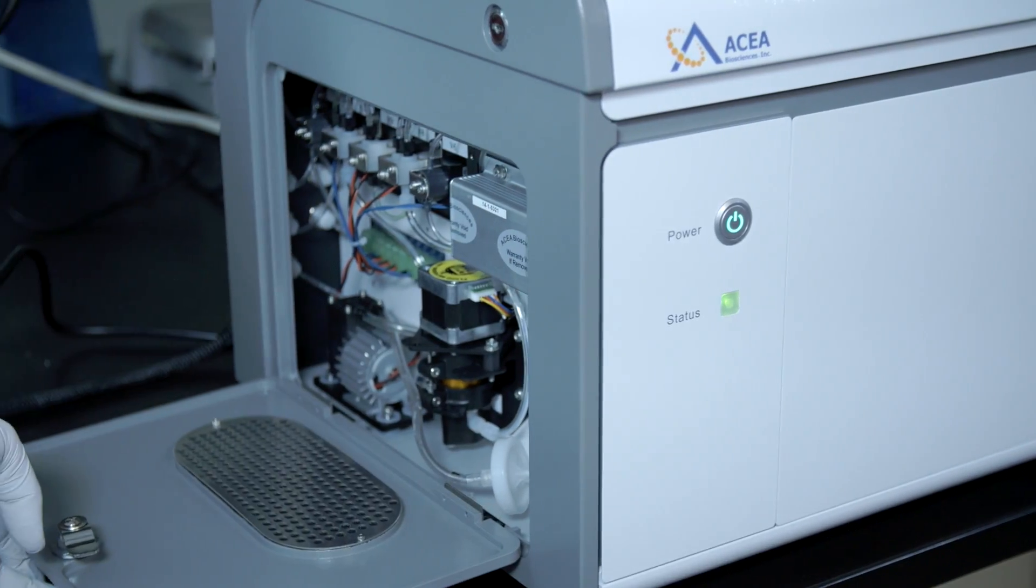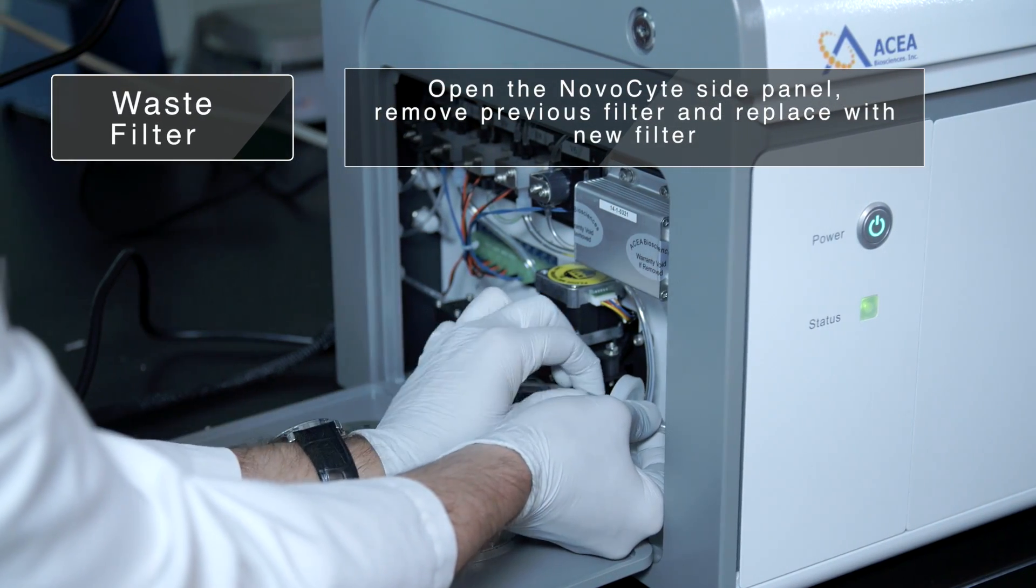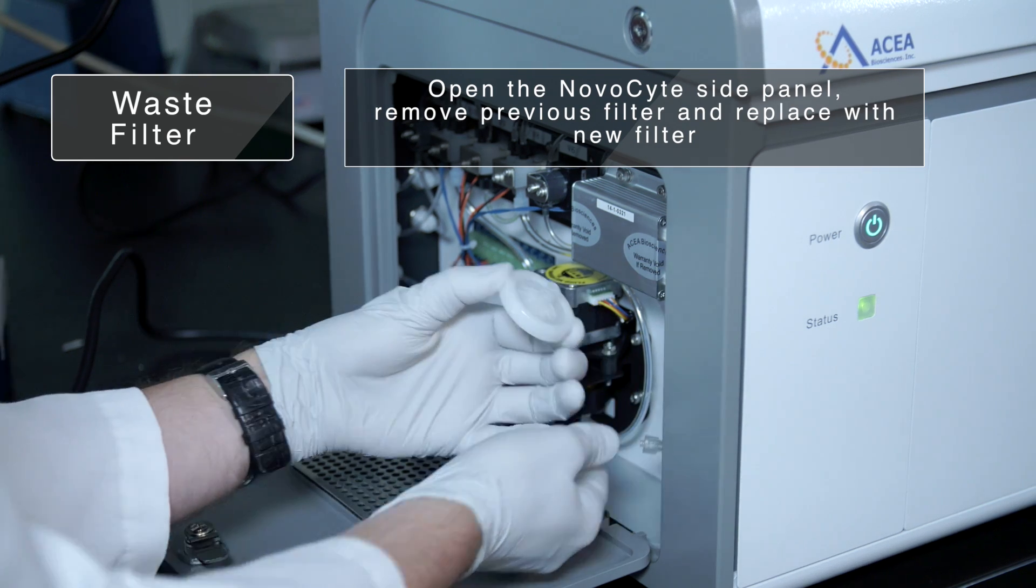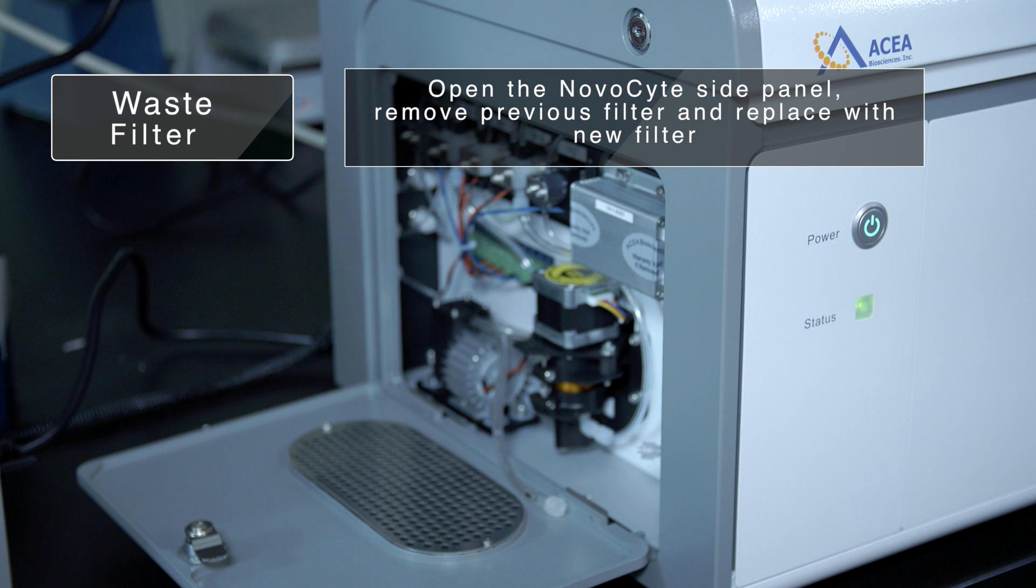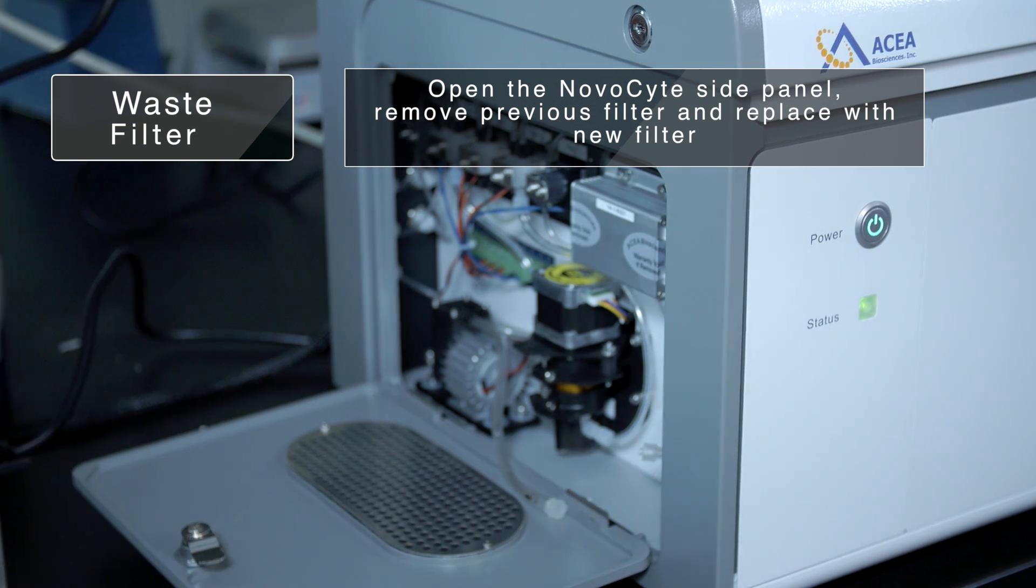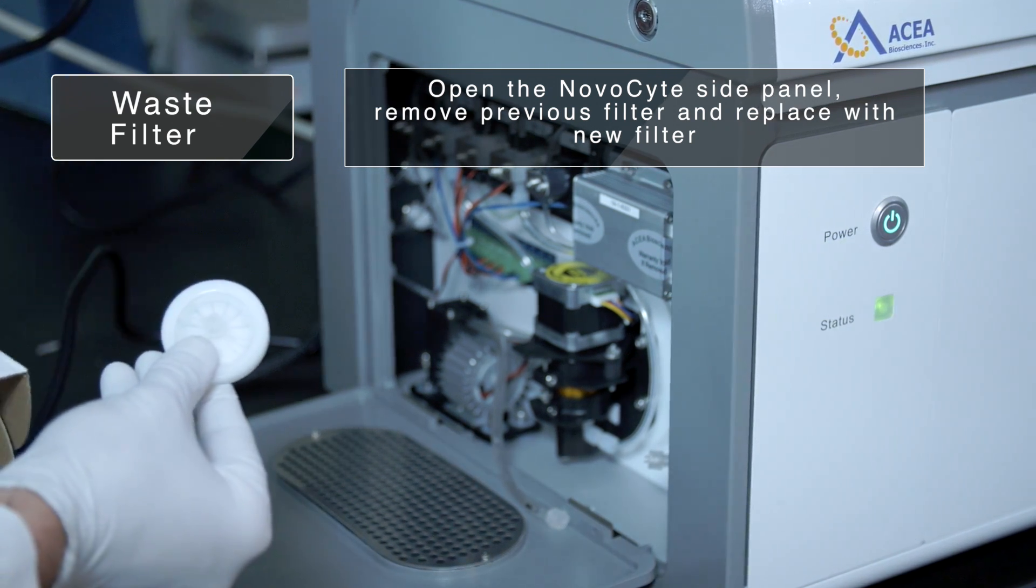For the waste filter, disconnect the two tubes on either side of the filter. Make sure the filter is oriented in the correct direction and reconnect the tubing.